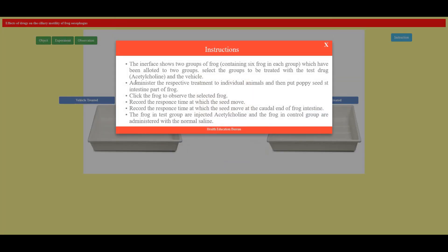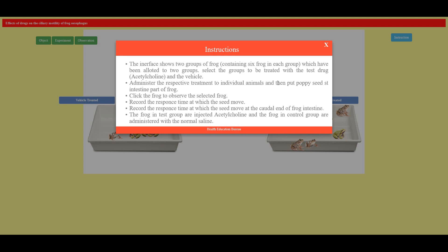Let's go through the experiment points. The interface shows two groups of frog containing six in each group which have been allotted to two groups. Select the groups to be treated with the test drug, acetylcholine and the vehicle.